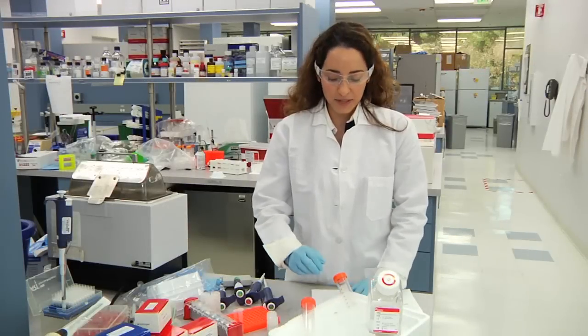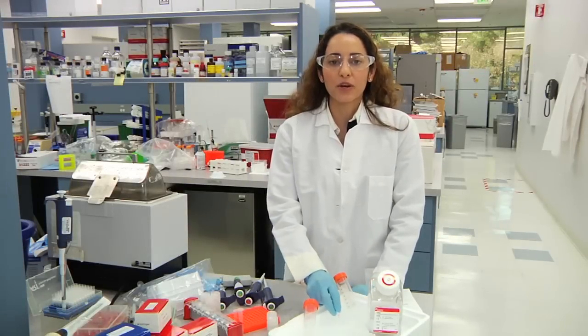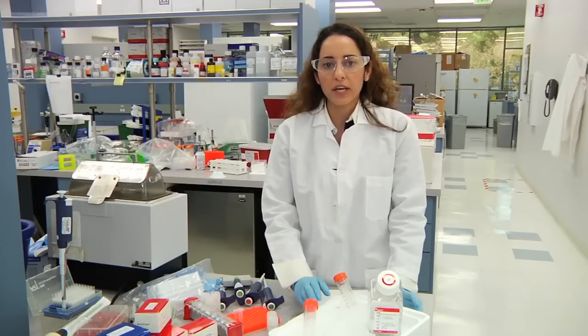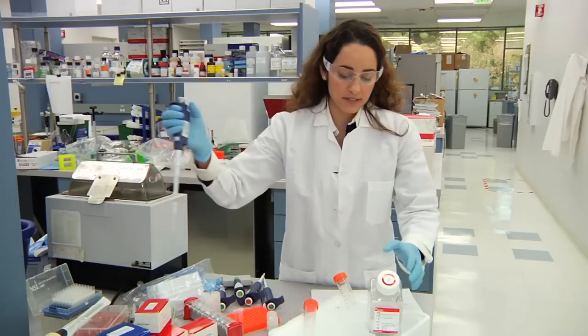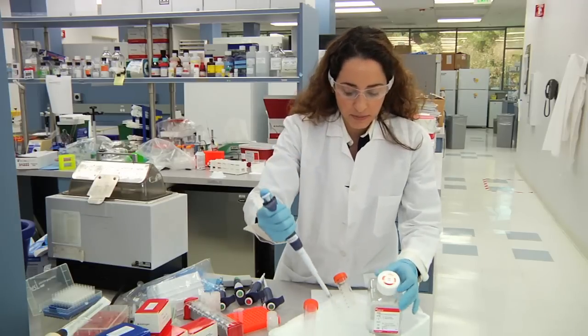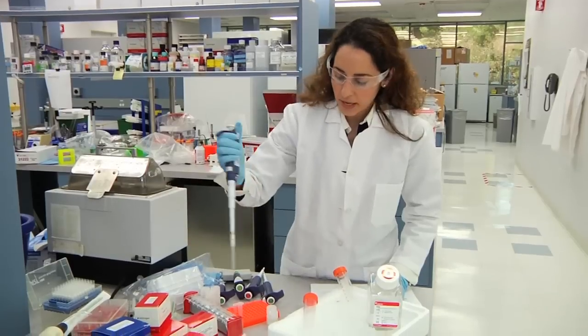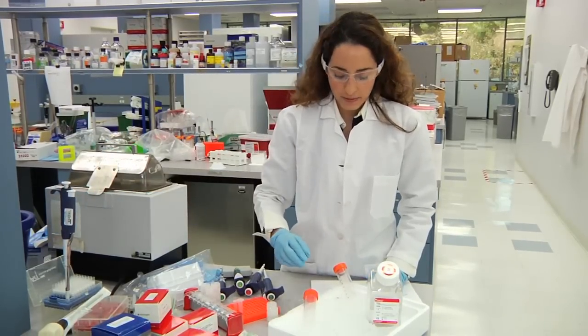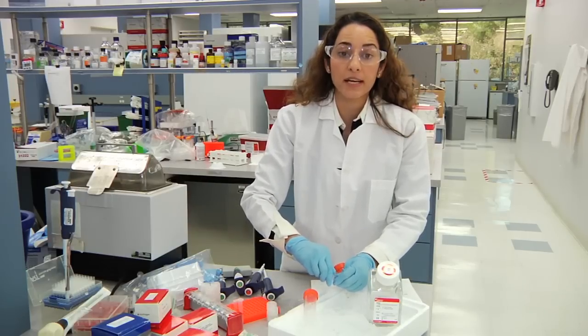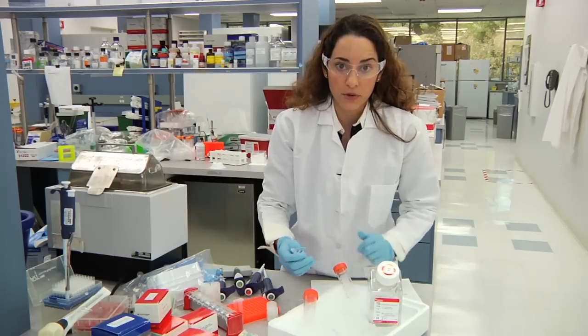Step one: we're going to start by weighing between 50 to 1,000 milligrams of fresh or frozen tissue. You're going to want to put a Petri dish on ice, make sure everything is kept cold. You're going to add 250 microliters of 1x PBS to your Petri dish that has been placed on ice, then add your tissue onto the Petri dish in order to do the second step, which is mincing with a razor blade.